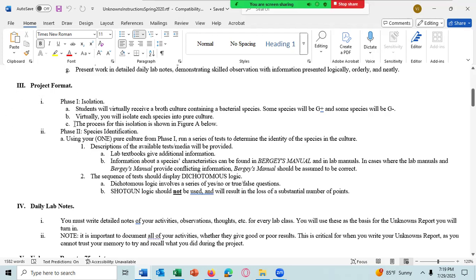Now, we're online, so I decided to simplify it, and we're just sending out one number of one species, but you should go through pretending that you are going to streak this out on a plate for getting isolated colonies. Take one single isolated colony and then streak it out on a second plate to get isolated colonies. Take an isolated colony from the second plate and then use that colony to set up your stock culture. And then use your stock culture for all future tests.